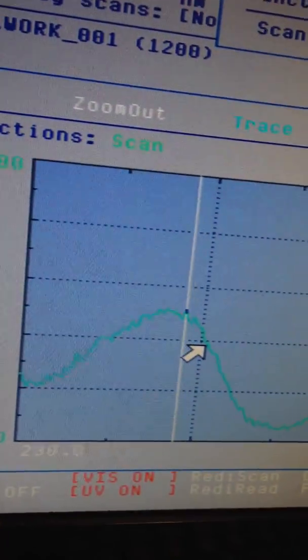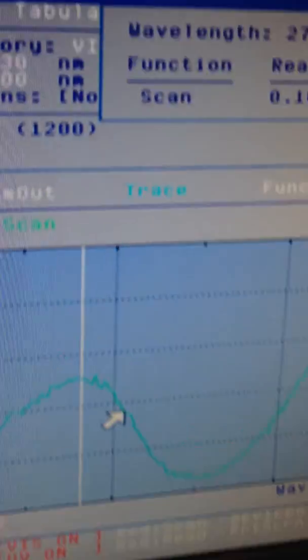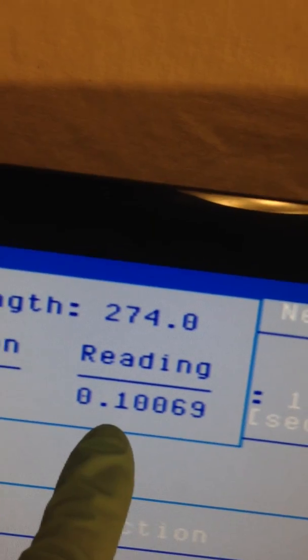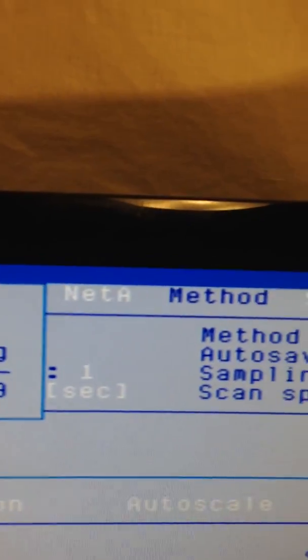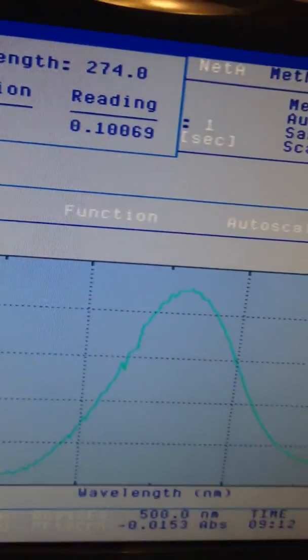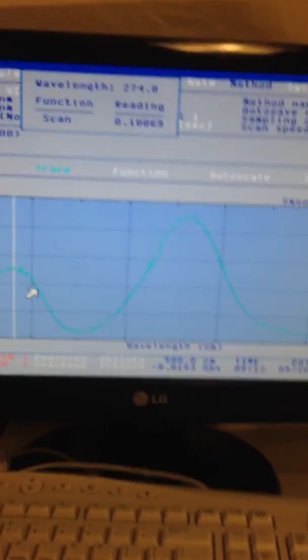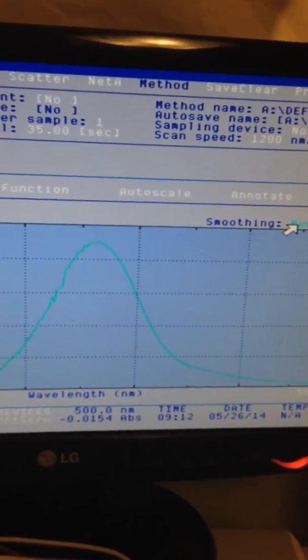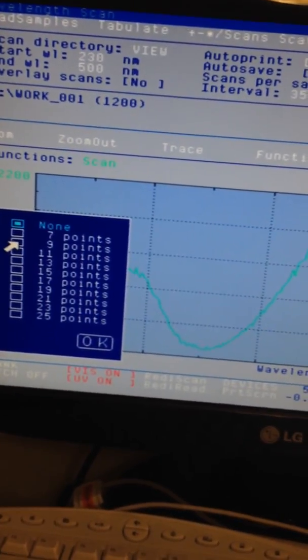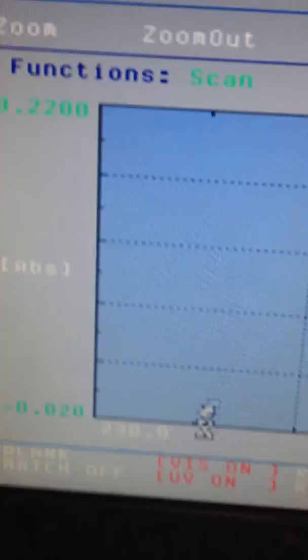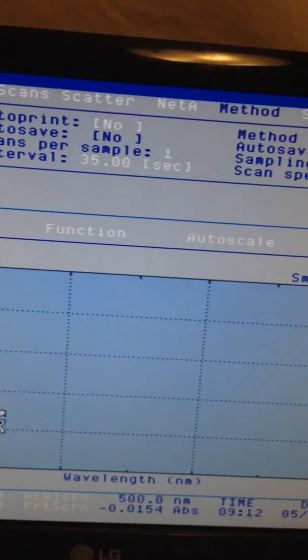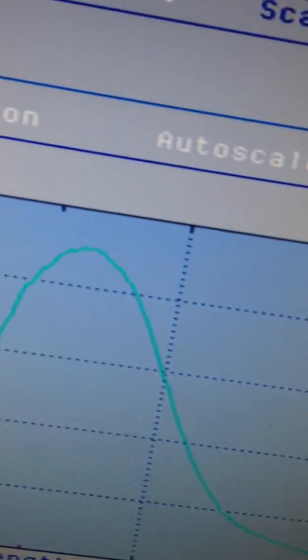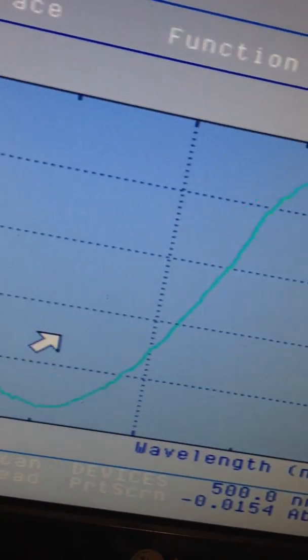There's another absorption here at 274 nanometers, which is not bad. You can smooth this spectrum and perform nine-point smoothing, which will give a much smoother line.